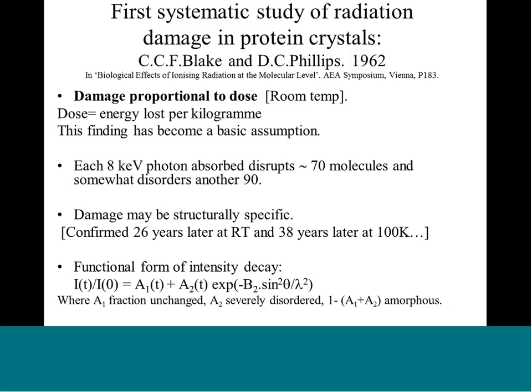They came up with the idea that the functional form of this intensity decay didn't fit a simple exponential. There needed to be a fraction that was unchanged — the A1 term at the beginning, which is time dependent — and then the fraction that's severely disordered, and the rest becomes completely amorphous. The proportion representing the whole minus A1 minus A2 will be completely useless in terms of ordered material and will not diffract anymore. This just shows their experiment.